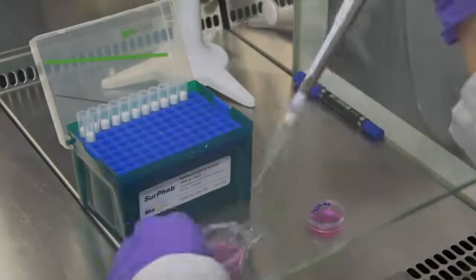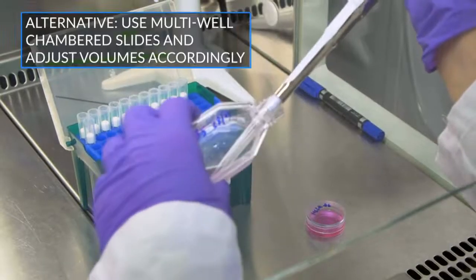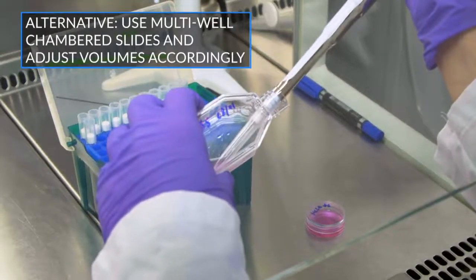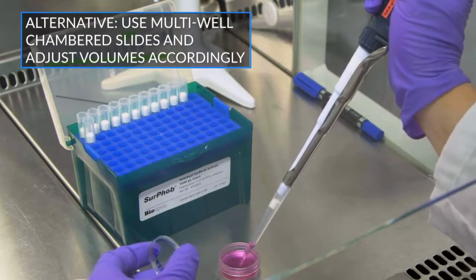One day before the labeling procedure, culture 4 times 10 to the 5th HeLa cells in 2 milliliters of medium in a 35mm Petri dish.